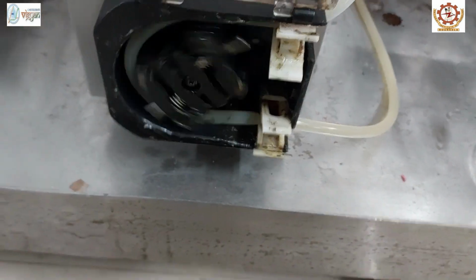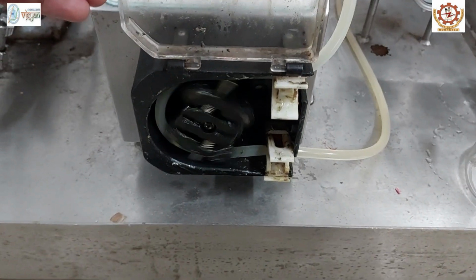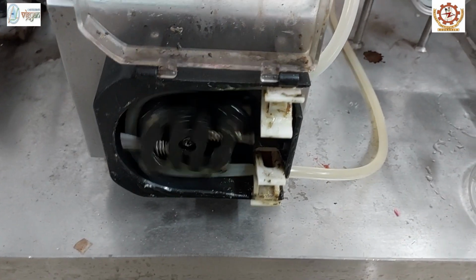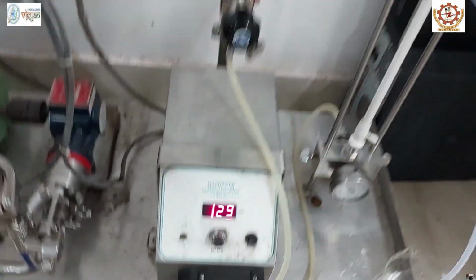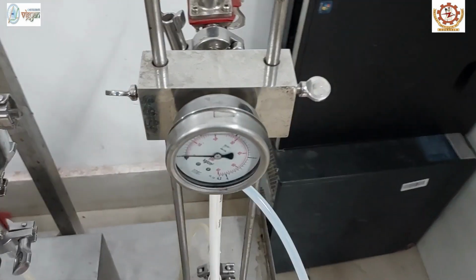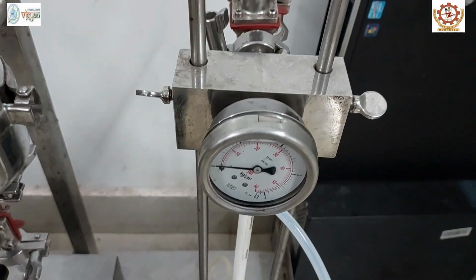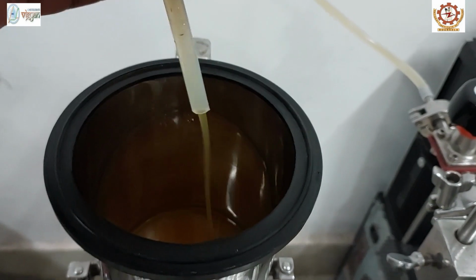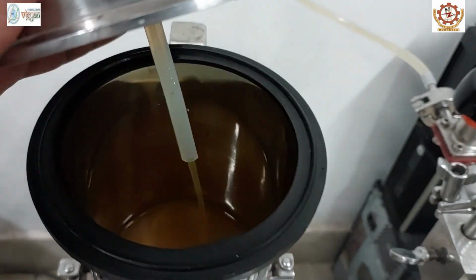The peristaltic pump is rotating at 129 rpm. And since the pressure is 0, all the juice is flowing back to the feed tank through the silicone tube.